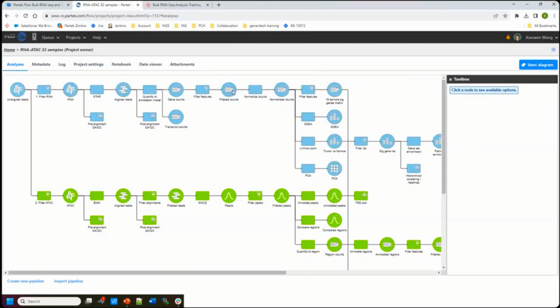I think it is probably too much, especially if you have a very low number of samples, you're going to have a hard time passing FDR. So all data analysis is iterative, okay?